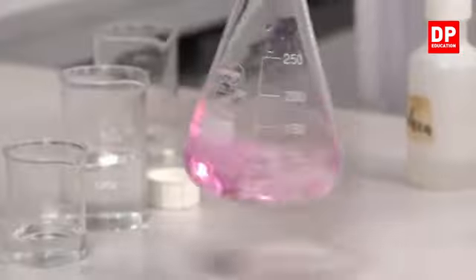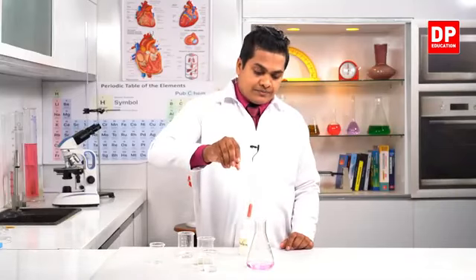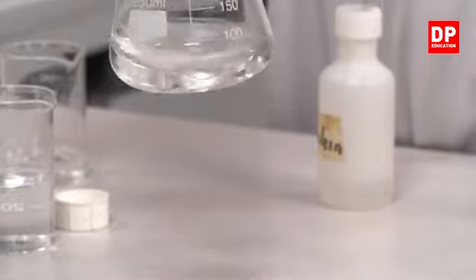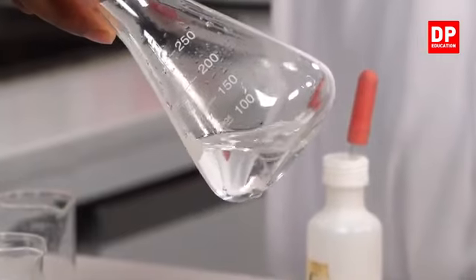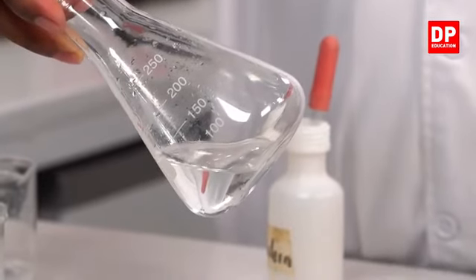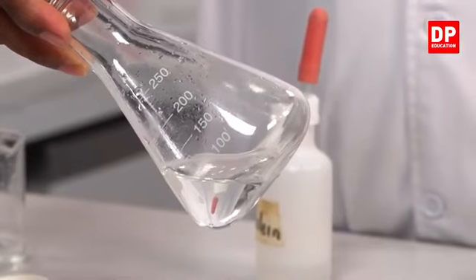So we'll mix it once again and we'll add another drop to see what will happen to our solution. Right, my dear children, now you can observe the color has disappeared totally. Meaning if you check this solution, there is no pink color in it, so this solution has now become a neutralized substance.